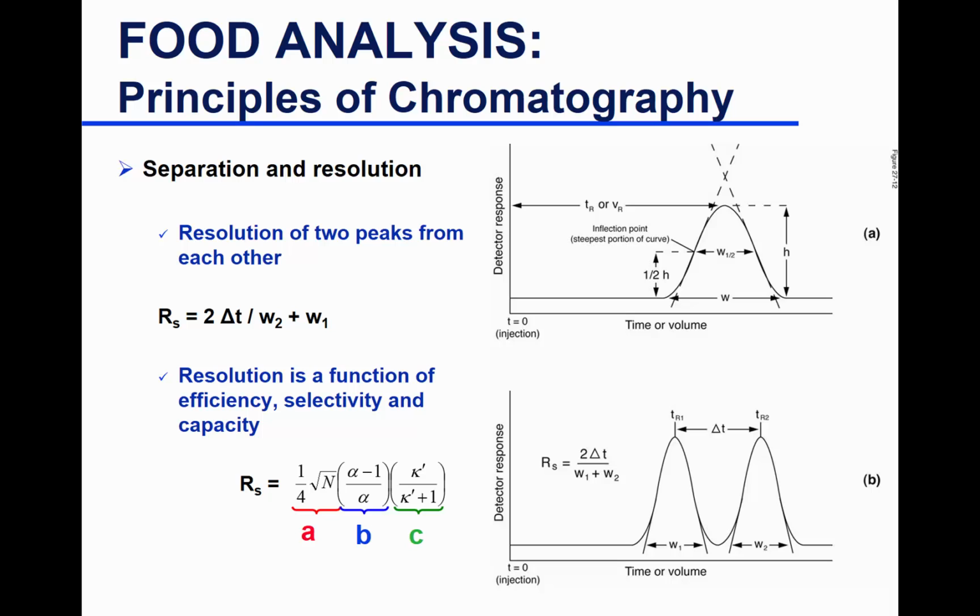If you have diffusion quite a bit, eventually this is going to spread out as it goes down. And because it's spread out, it's going to look like this one. You don't want that to happen. You want your movement to be more this way rather than this way. So you want it to be a sharp peak.